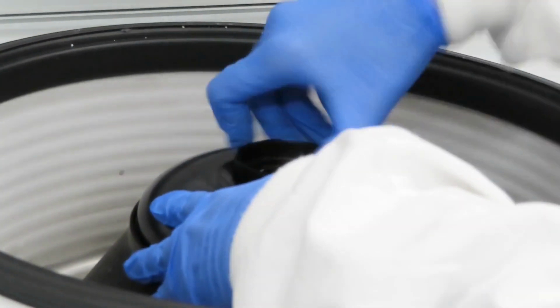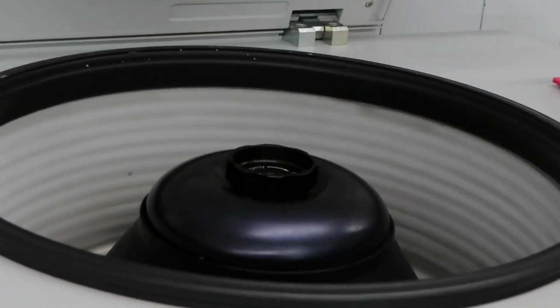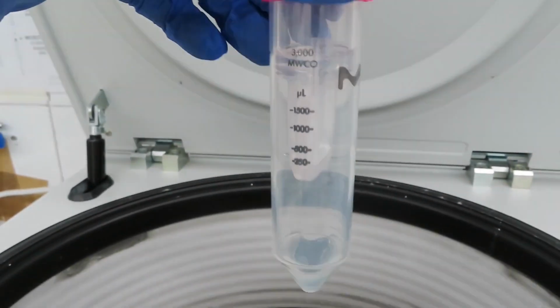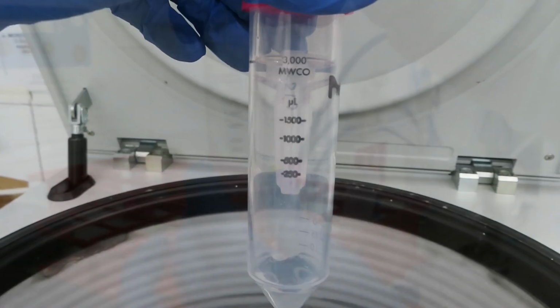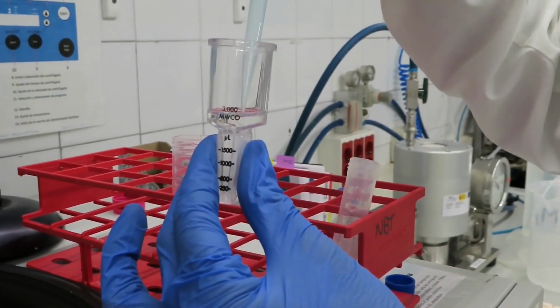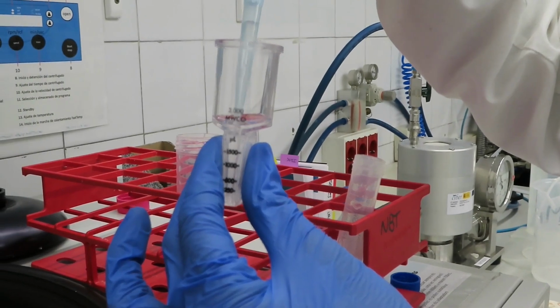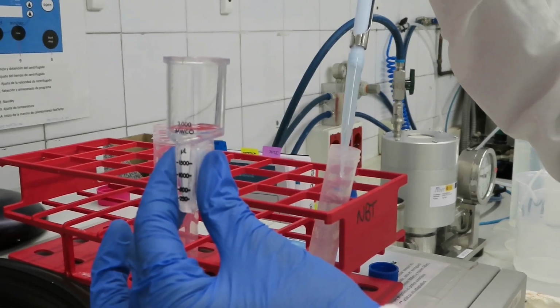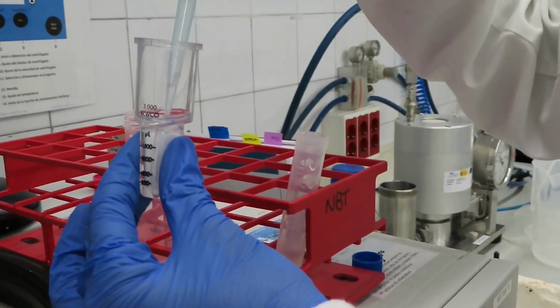In both cases, it's usually necessary to concentrate the sample, which is carried out by centrifuging the sample in tubes with a filter that allows the passage of the buffer but not the protein. In this way, the sample is delivered at the concentration required by the customer, or in case of continuing with the purification, the sample volume has been reduced to perform the next step, the preparative size exclusion chromatography.